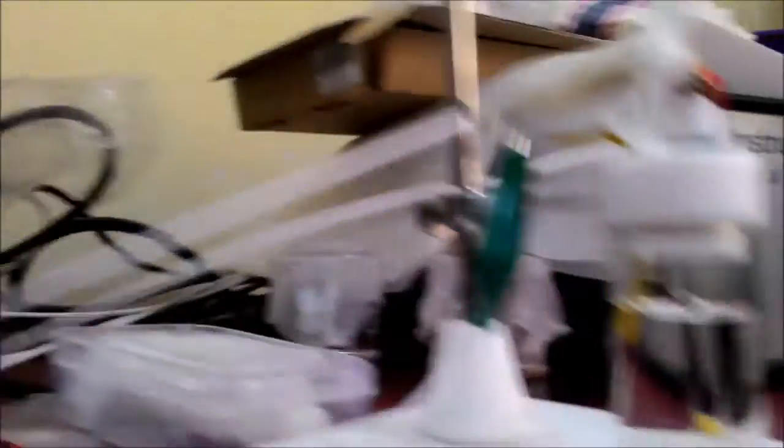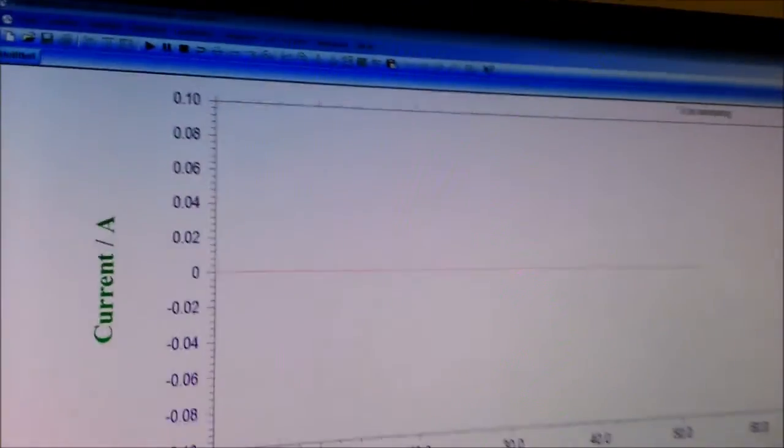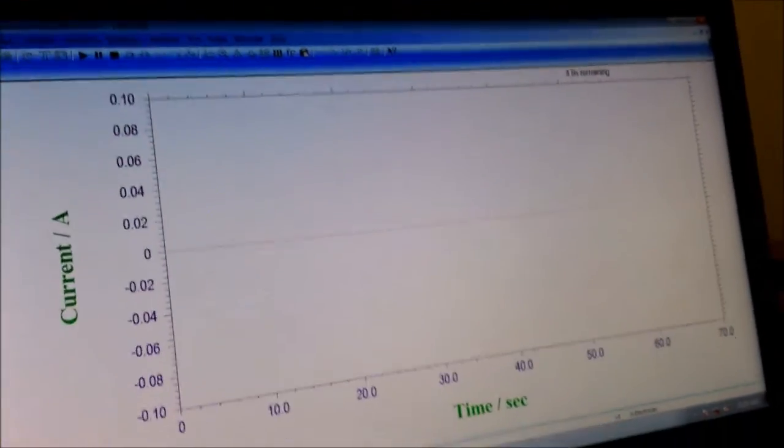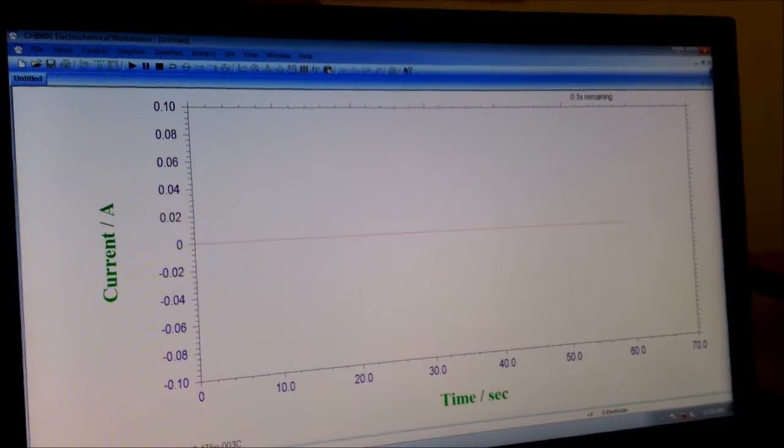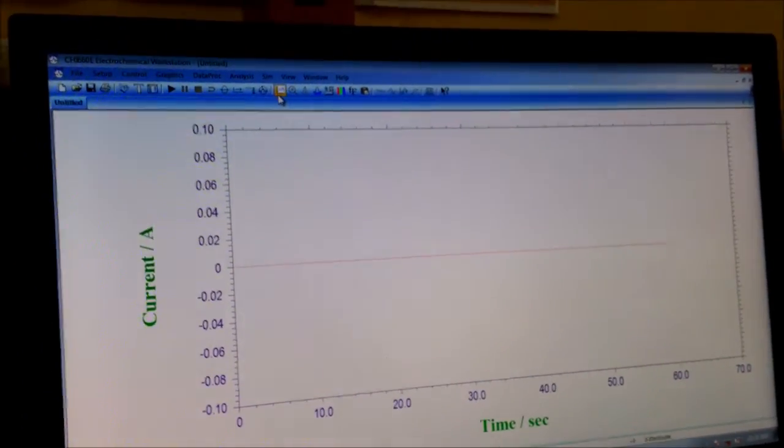60 seconds is over, so the electro-deposition is finished.